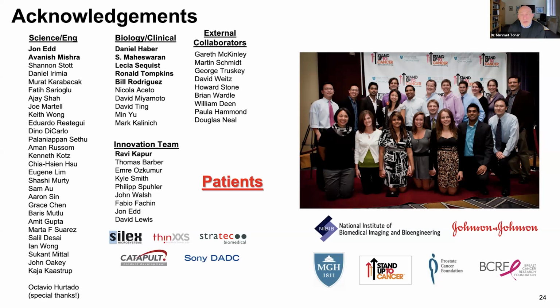And of course, many resources funded the projects, and big thanks to our patients, because we deal with 2,000 to 3,000 patient samples a year. We work pretty much all with real patient bodily fluids: ascites, bronchoalveolar fluids, blood, bone marrow, leukopak. We developed our tools validating them. And that's the advantage of being a microfluidics lab in a hospital. We try to take full advantage of that.